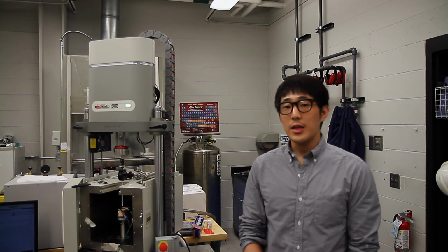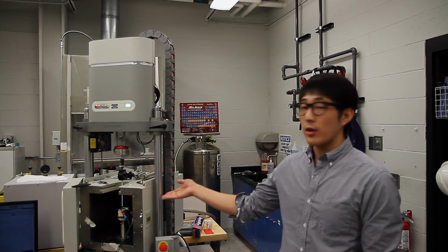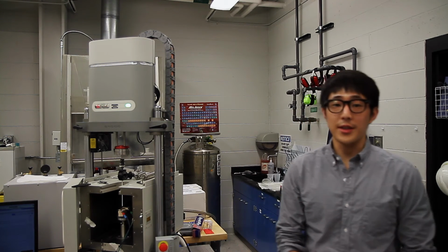Back to my research experience, we use the Instron ElectroPuls E1000 to perform tensile tests on this material. We have obtained data, and now we need more time to further analyze its property. Here is a video of the testing.